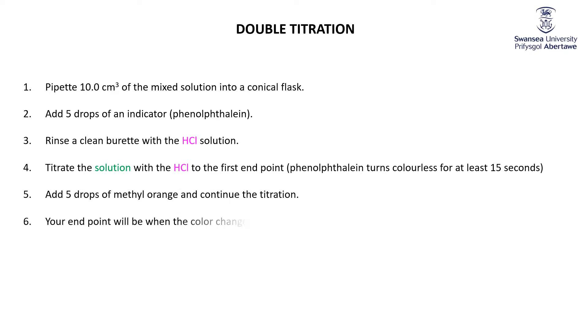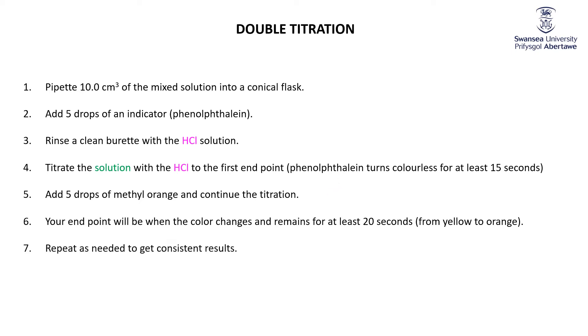Then we're going to add in the methyl orange, continue the titration, and wait until the color changes from yellow in the more basic solution to orange in the acidic solution. And of course, repeats are needed to get consistent results.